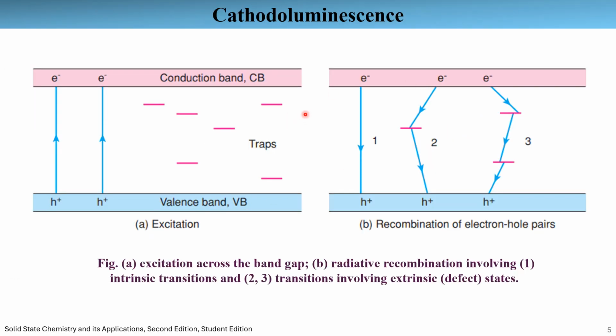Cathodoluminescence emission refers to the emission of visible light in response to electron bombardment in the electron microscope. Electron bombardment induces various ionization processes and electronic transitions in non-metallic materials, or promotion of electrons from the valence band to the conduction band.